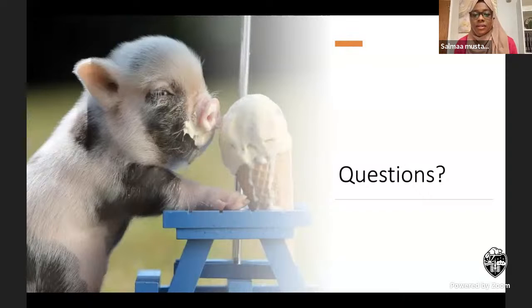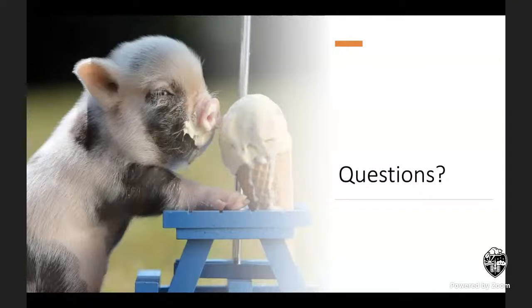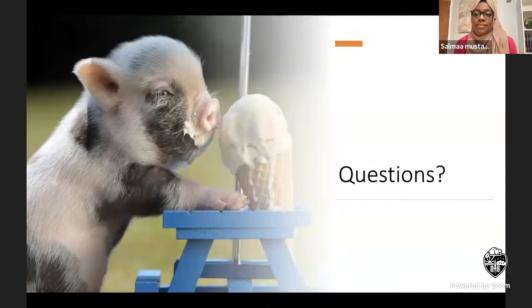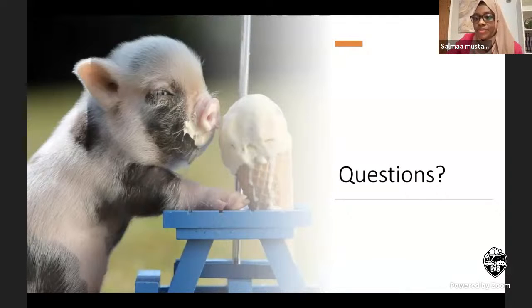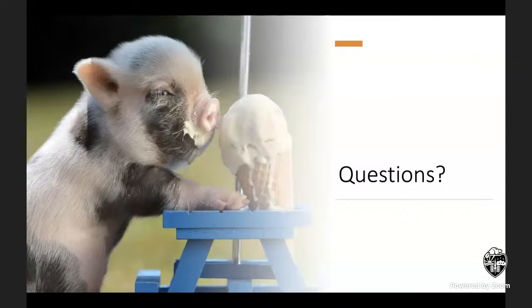Can you explain more about this? For example, the multiplication rate of the macrophages is not the same as for kidney cells. Right. Okay, so how did you do all these experiments for different types of cells, and definitely you need to do dilution for the primary antibodies, right? Yeah, this is the second one. So the second question: was the dilution of the antibodies the same for all these types of cells? Yes. Okay. So can you explain that, please?